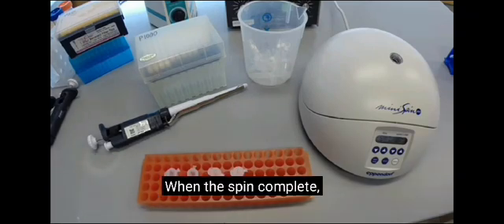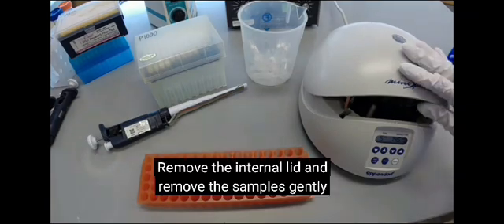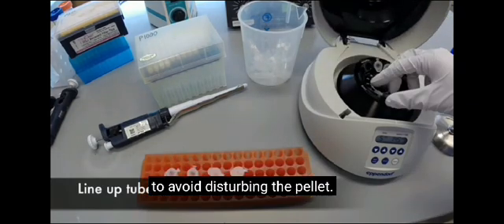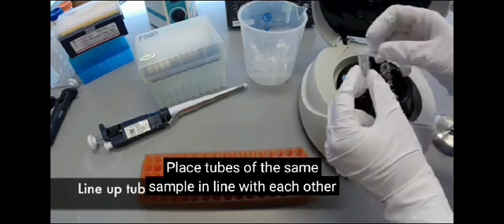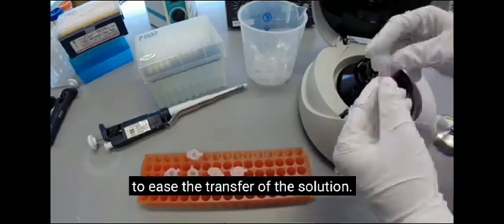When the spin is complete, the lid to the centrifuge will pop open. Remove the internal lid and remove the samples gently to avoid disturbing the pellet. Place tubes of the same sample in line with each other to ease the transfer of the solution.